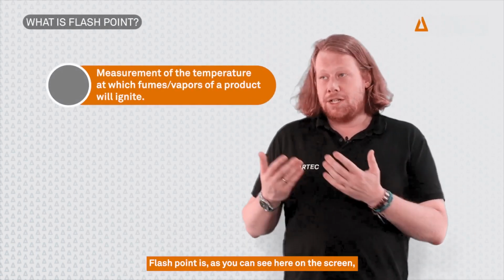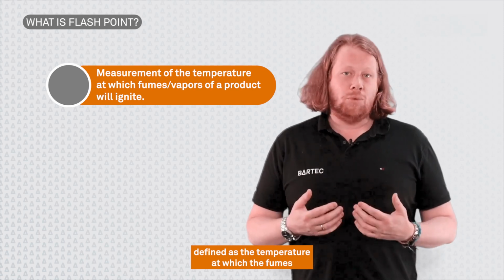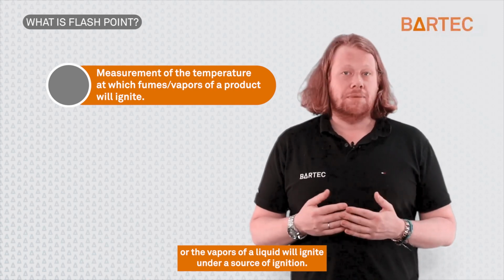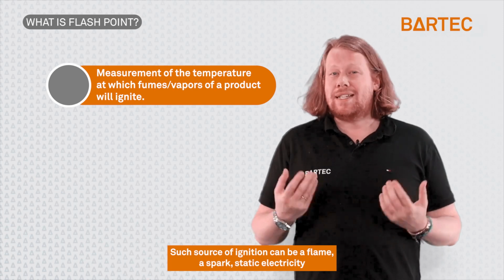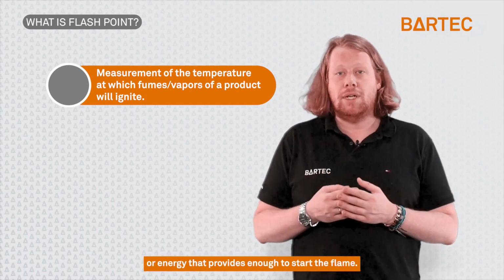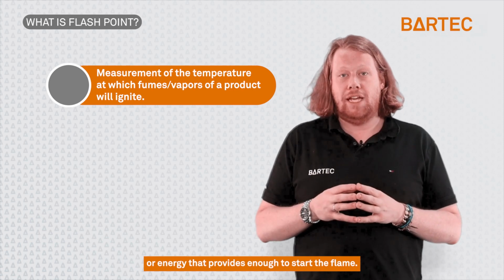So, flashpoint is, as you can see here on the screen, defined as the temperature at which the fumes or the vapors of a liquid will ignite under a source of ignition. Such a source of ignition can be a flame, a spark, static electricity that generates, again, a spark, and pretty much any source of heat or energy that provides enough to start the flames.